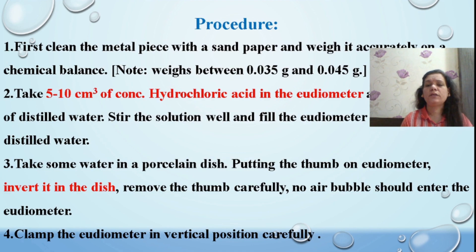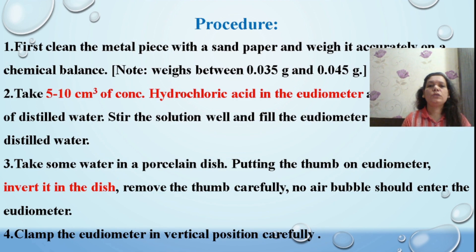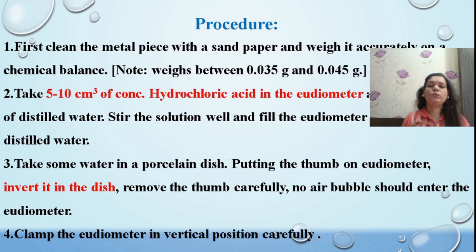We are going to use magnesium metal. If kept for a long time in a lab, it produces magnesium oxide on the surface, so you must polish the surface with sandpaper to make it active. Then weigh the polished magnesium in the range of 0.035 to 0.045 grams using a digital balance, and note down this weight in your notebook.